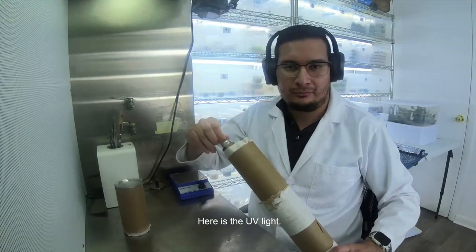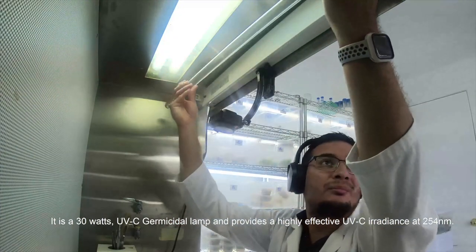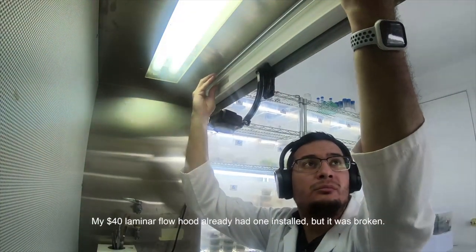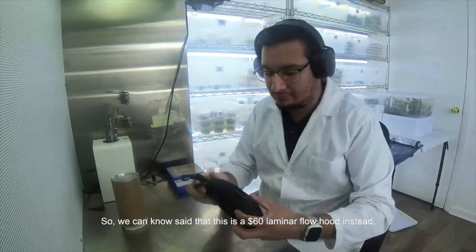Here is the UV light. It is a 30-watt UV-C germicidal lamp and provides a highly effective UV-C irradiance of 254 nanometers. My $40 laminar flow hood already had one installed, but it was broken. So now we can say that this is a $60 laminar flow hood instead.